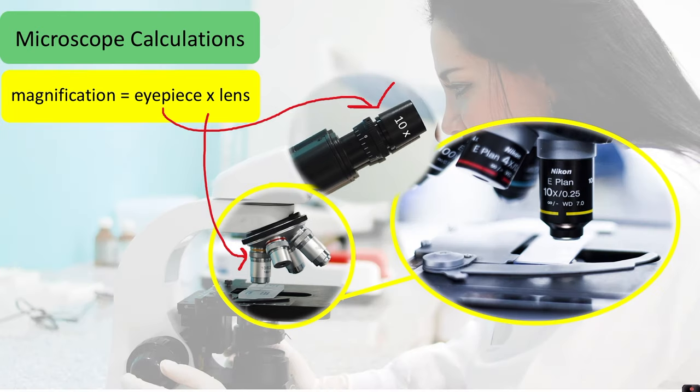You can see the yellow one here is 10 and next to that the red one is 4 and the one to the left which you can't quite see is a hundred times. When you do your calculation you do the number on the eyepiece multiplied by the number on the lens you are using. So in this case we would have a magnification of 10 from the eyepiece multiplied by 10 from the lens which means we will be viewing our object at a hundred times magnified.